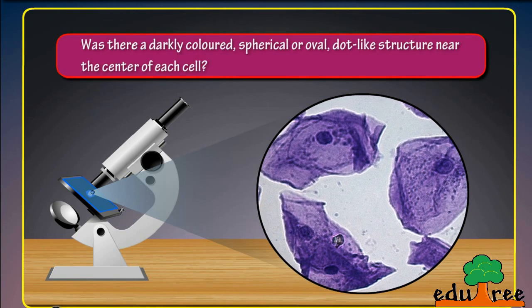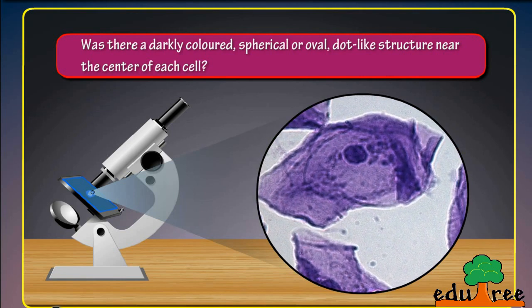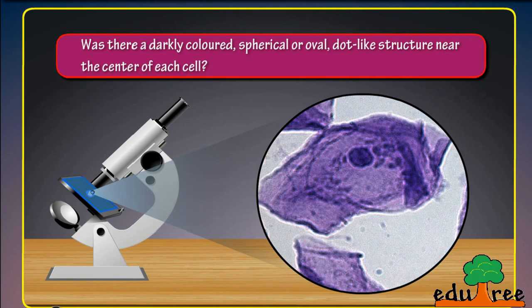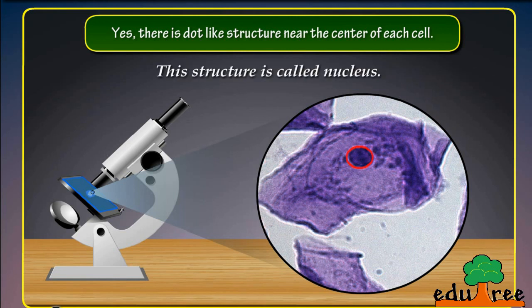Was there a darkly colored, spherical or oval, dot-like structure near the center of each cell? Yes, there is a dot-like structure near the center of each cell. This structure is called nucleus.